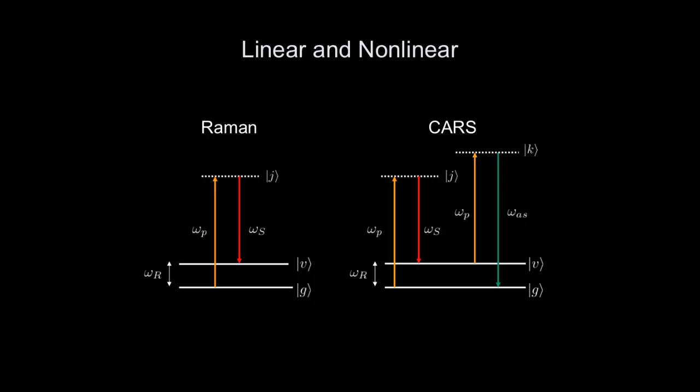So here is another way of doing the same thing, much more complex, but if you look at the first section here, it's the same. We come in with this first pulse, then we have a second beam that's not just emitted by the molecule, but applied by us. So these two actively drive this transition, and then this photon converts that information into this green photon that we can intercept. This is called a nonlinear Raman process, which is much more complicated than linear Raman.